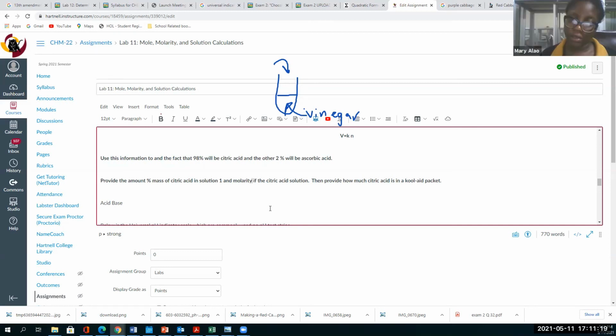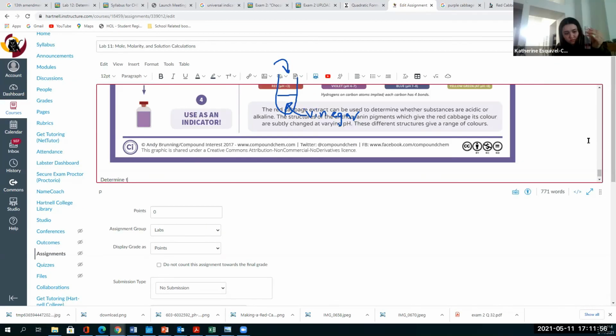Yeah, I was happy I got exactly red. So I was like, okay, so good night, Dr. Henry, or good evening. Good night. Yeah. So it stayed at a red.